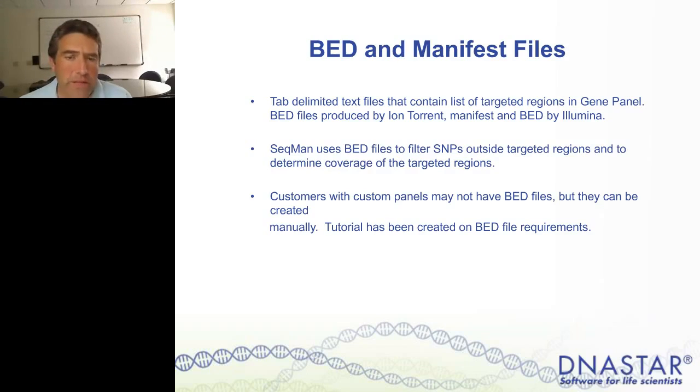We have a tutorial that can show someone how to convert a text file into a bed file. This is pretty common. If you're working with this kind of data, you may very well have just a list of gene targets. And so it is possible to make a bed file from scratch if needed.